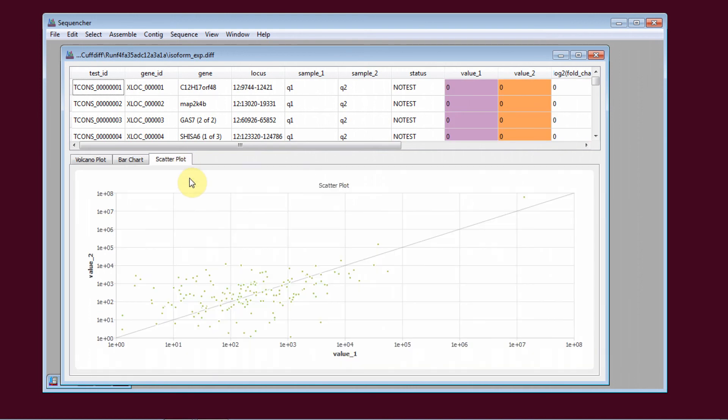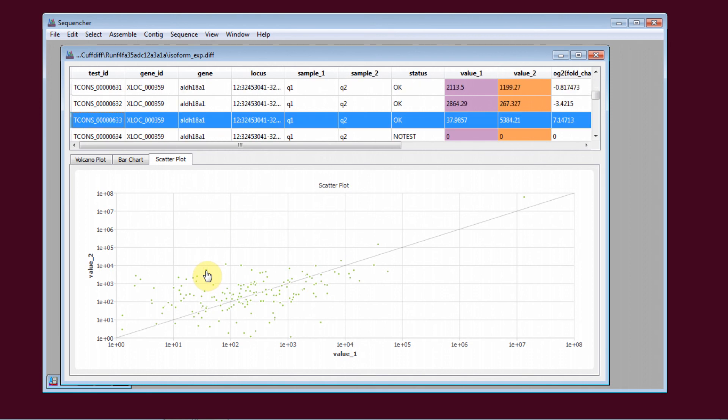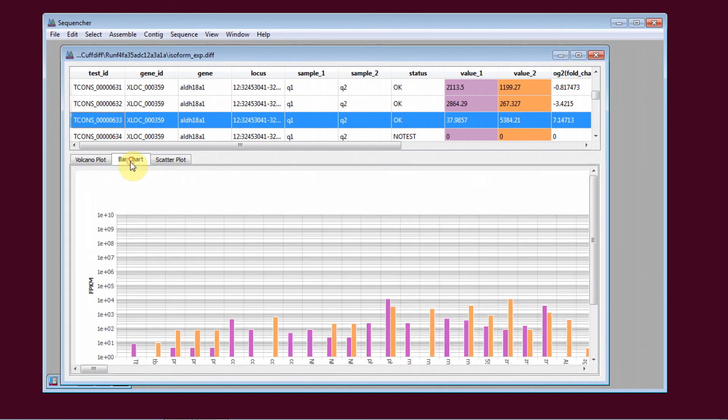In each case, if you click on a dot or bar, it will take you to that point in the data table so that you can investigate further.